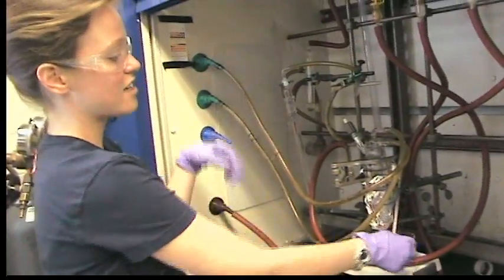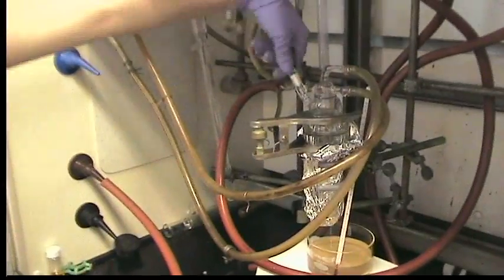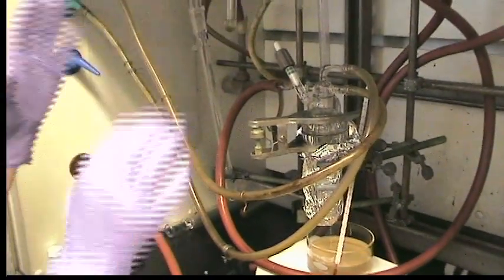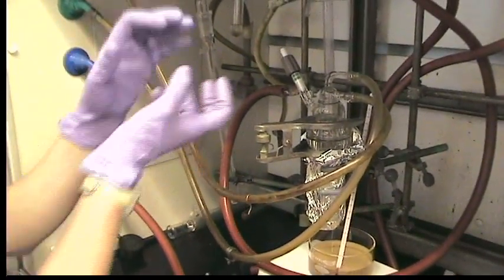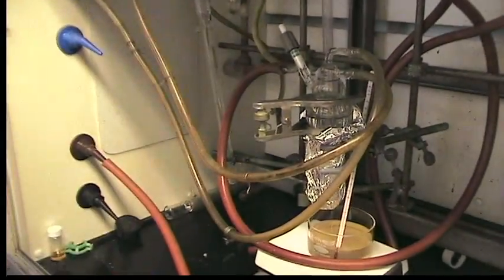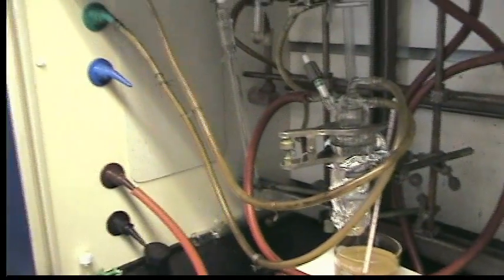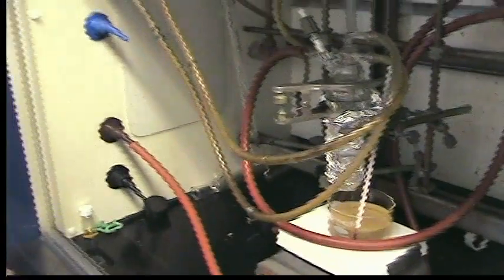So now that this line has been pumped out for a while, we'll open it to the sublimator. Now that we have a cold finger and we have vacuum going, we'll drape this with another piece of aluminum foil and we'll just put the bottom of the sublimator into the oil bath.